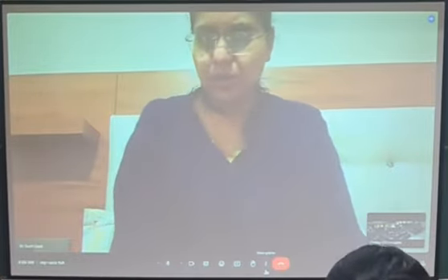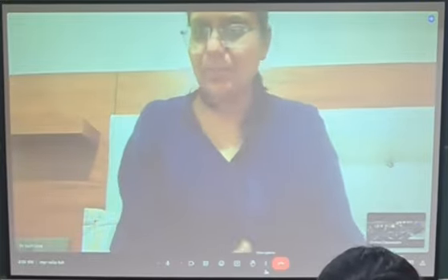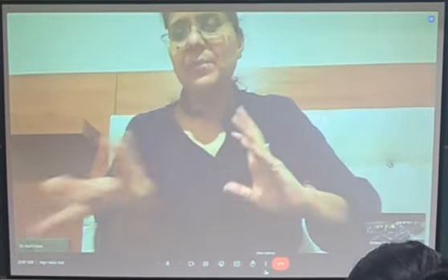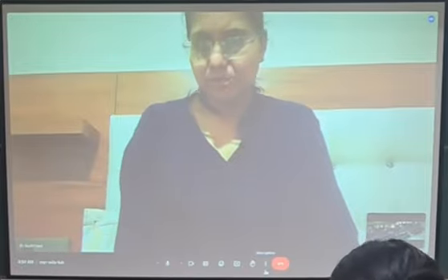Does that not look okay to you? Yes, this is a simple method, isn't it? I don't need a reference to do it. I can just take the culture directly and plate it on media, which is much easier. I will not waste my reagents also.